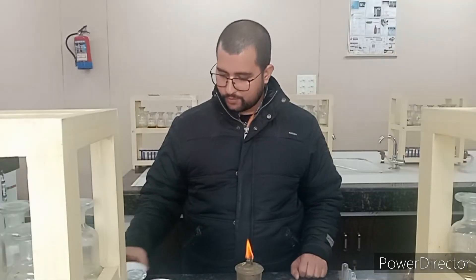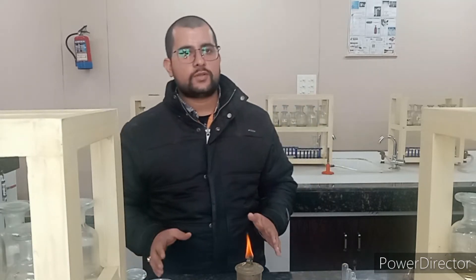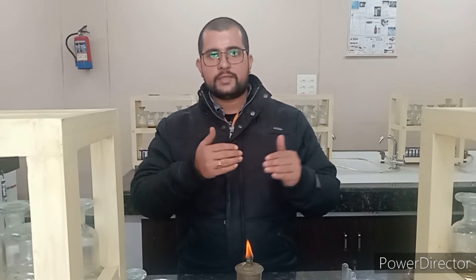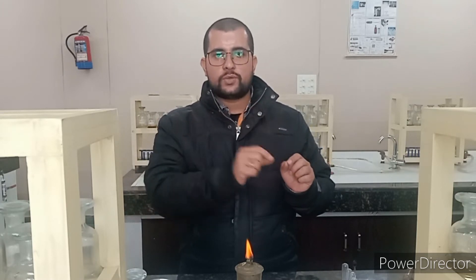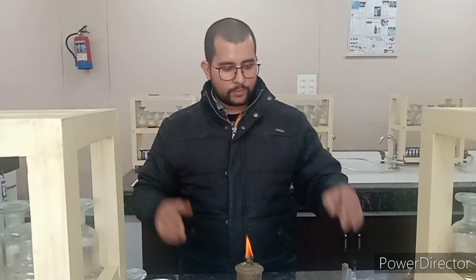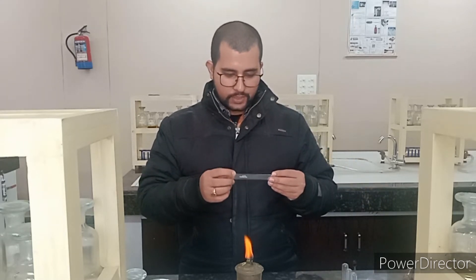Now we are going to test for the cation of Group 2. We know this is a Group 2 salt, so it will be in that group. But when you do an unknown salt, you have to apply this method — do it with zero group, first group, second group, third group and so on. I am going to make a clear solution and then add the group reagent.